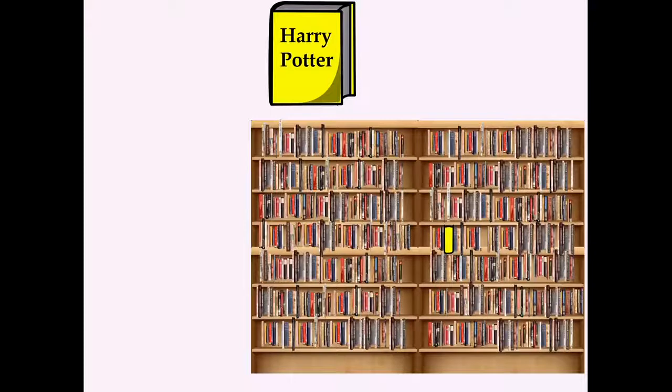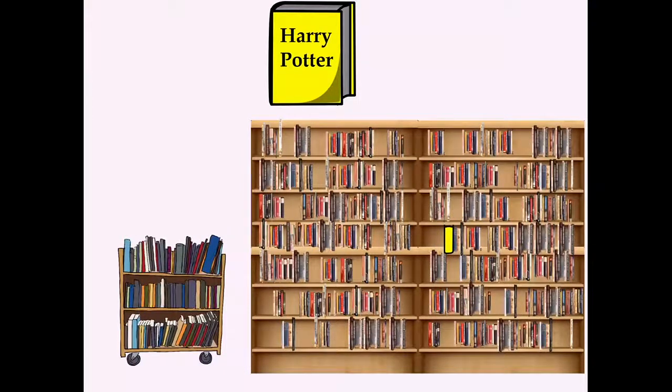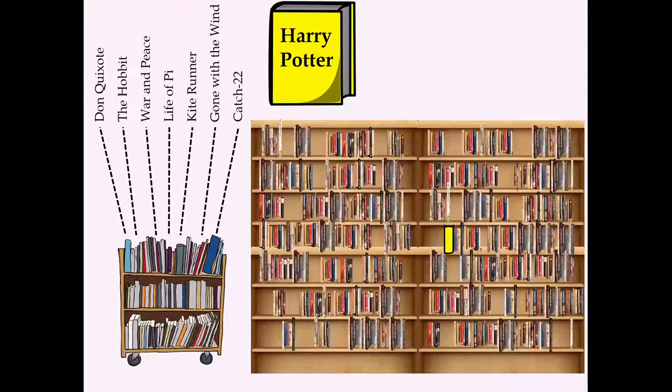And so let's say you're going to do this by data-dependent acquisition. The analogy for data-dependent acquisition would be that you told the librarian to just go randomly pick out books in the library, and you hope that you happen to select it, right? So then you go and you select it, and you say, these are the books that were on this cart that the librarian pulled out, and none of them happened to be the book that you're interested in.